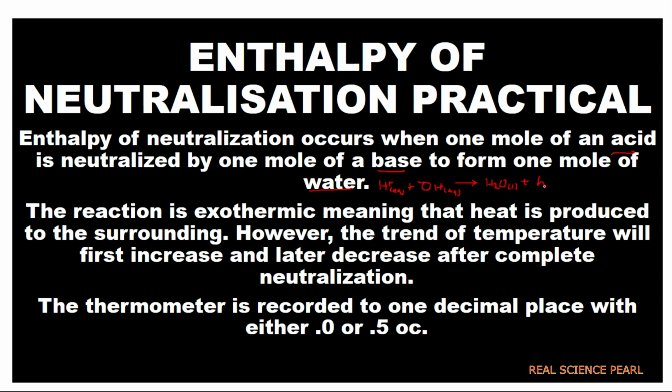plus the heat. Now, since I've said plus heat, it means the reaction is exothermic, meaning the heat is produced to the surrounding. We expect the temperature to rise when we use a thermometer.